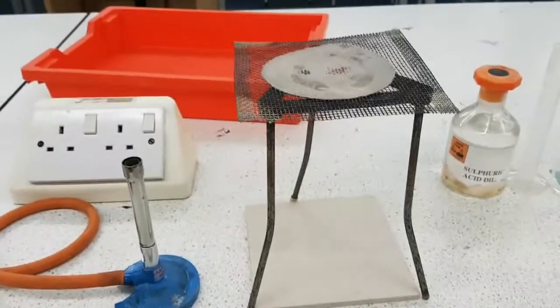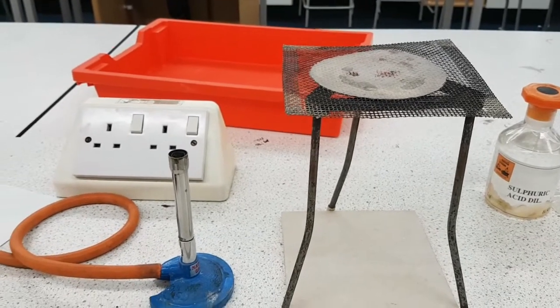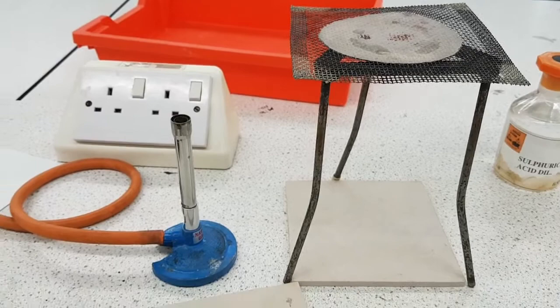In the words of the Russian hacker, welcome to my laboratory where safety is number one priority. The whole point of this practical is we are going to make a salt from an insoluble compound called copper 2 oxide.